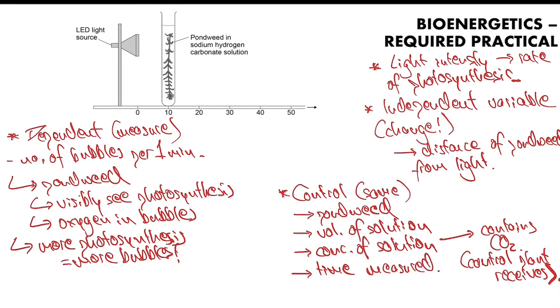Now, a couple of other key things to bear in mind about this practical. Sometimes people mention that it's worth cutting the top of the pondweed before you put it in. That's to allow oxygen bubbles to form at the top and come out more quickly.